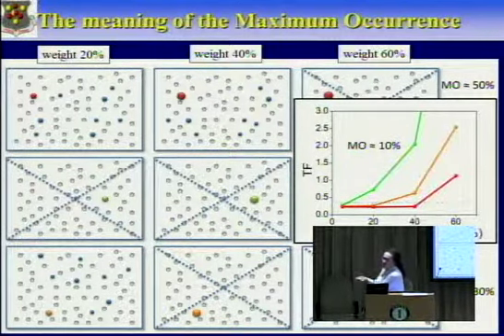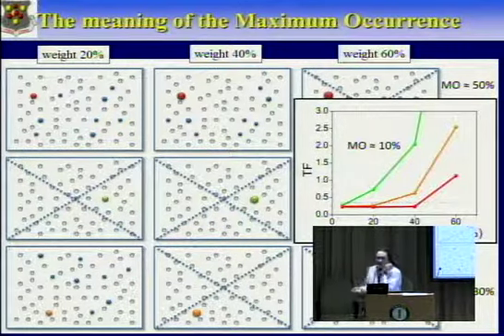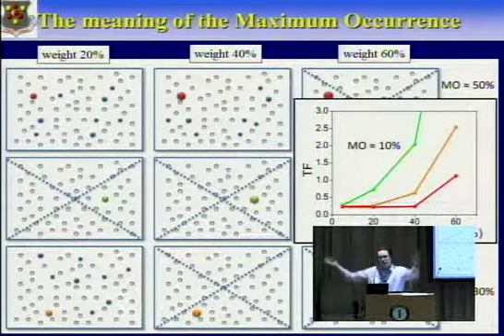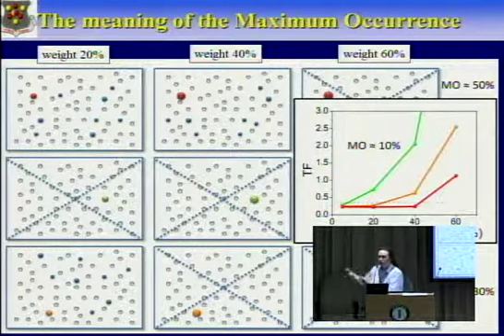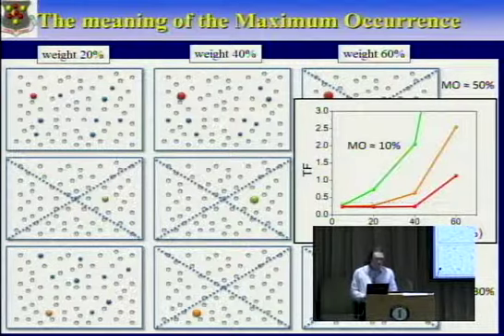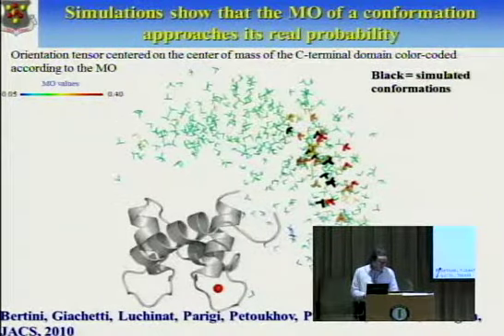Of course, this is a heuristic. We are not really providing a systematic search in space. We just try to generate enough conformations and enough ensembles within the domain of configurations that we hope to have mapped the space enough. Okay, this is the target function.